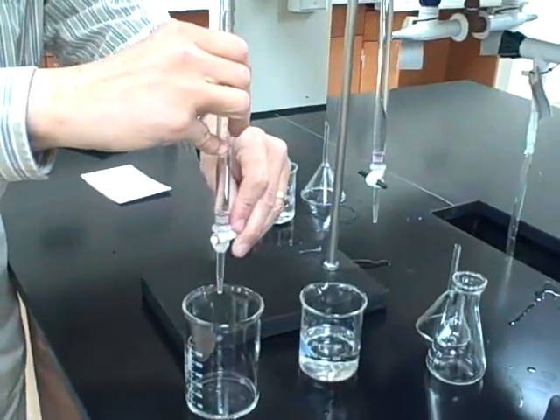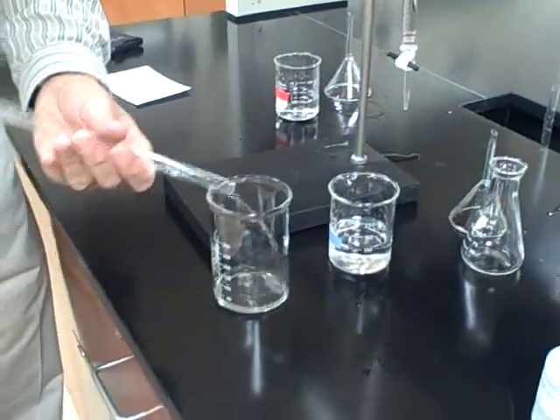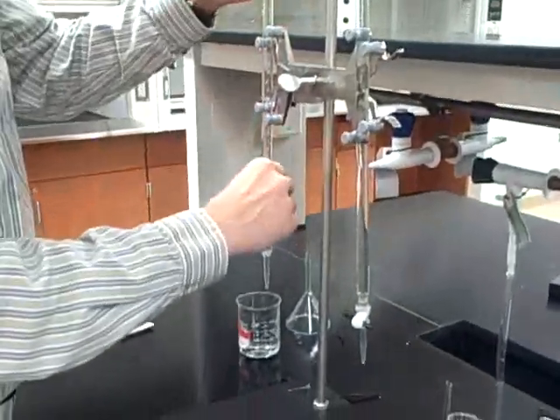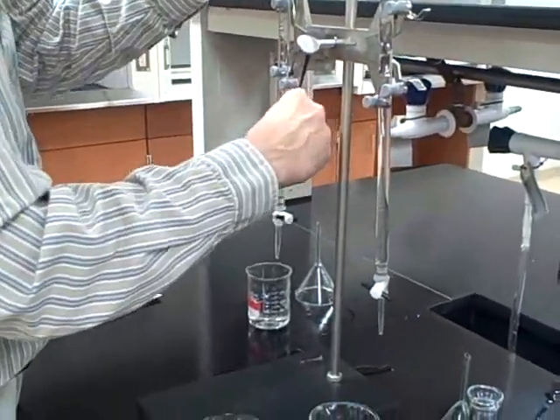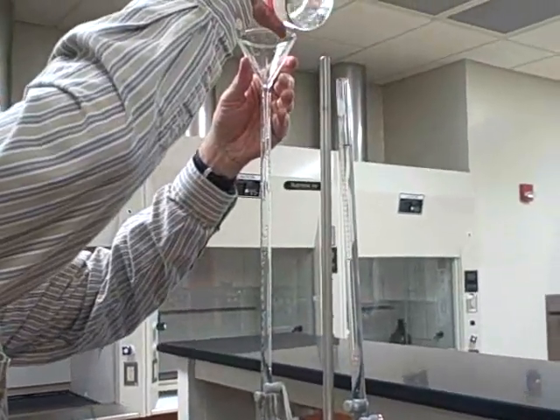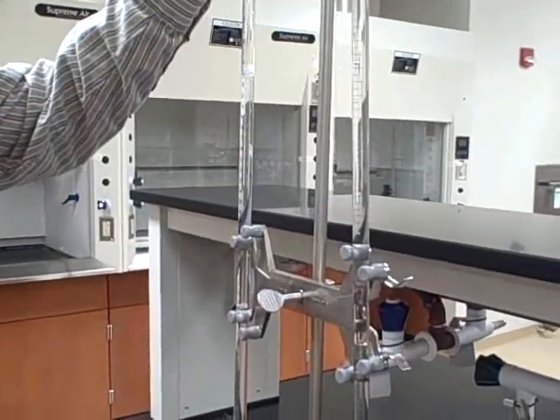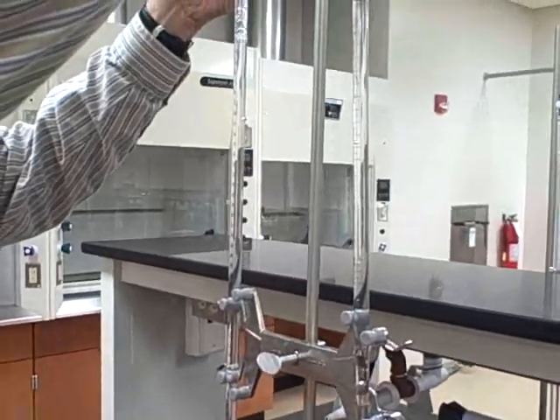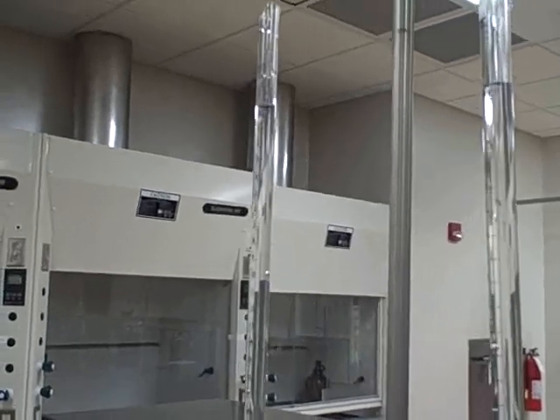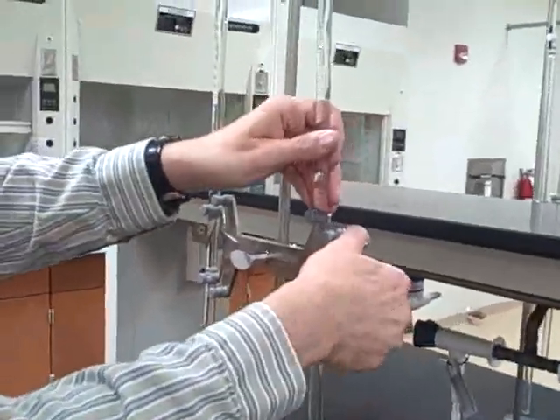Just want to rinse it a second time here and make sure that the tip and the body of the burette is flushed out with the solution that I'm using. And now I'm going to fill it up. That's my acid burette — now I'll get the base one ready.